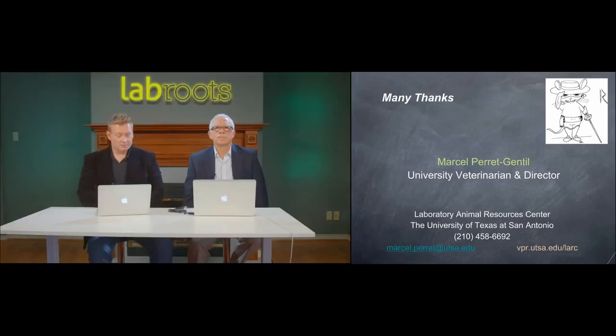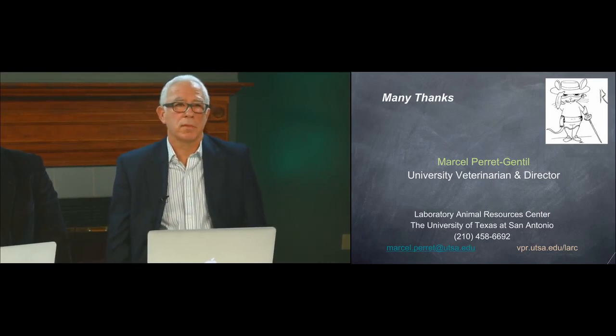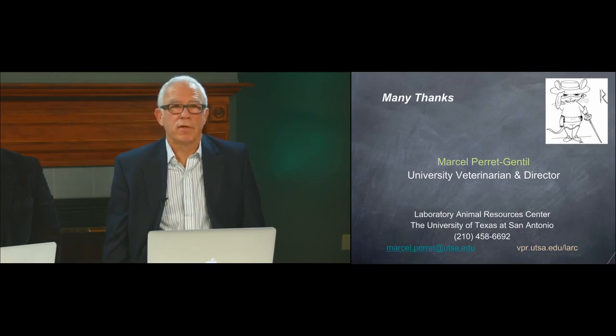The next question is from Ulysses Orchard from Rice University. The question is, I know you have advocated the use of press and seal in the past, but I have concerns that it advocates the use by other veterinarians. Due to the high volume of surgery, is it still a good drape to use? I don't know if you're talking about private practice or not, but I have had private practitioners contact me asking about it. I said, go for it. You can get repeat overlapping, and I wish, again, you could have seen the video where we do that on the table, but you can see overlapping sheets. You can actually apply overlapping sheets of press and seal and use it as a very inexpensive and effective drape for your animals. Not sure if I answered that. Is that what you understood too?